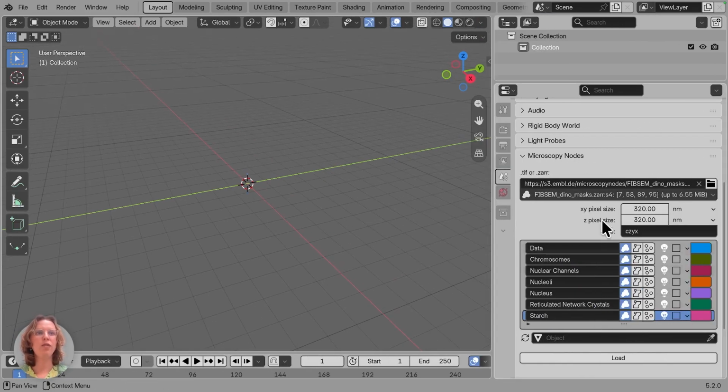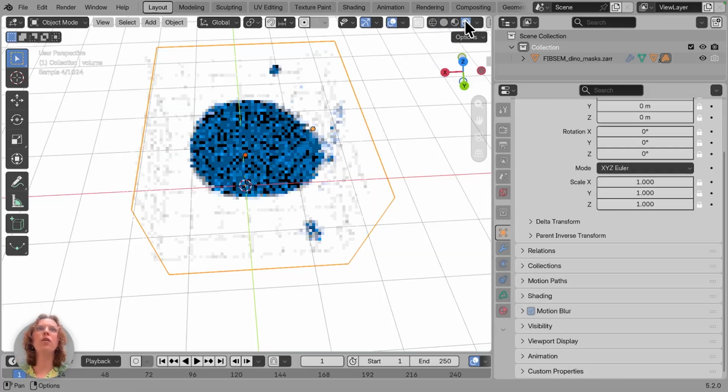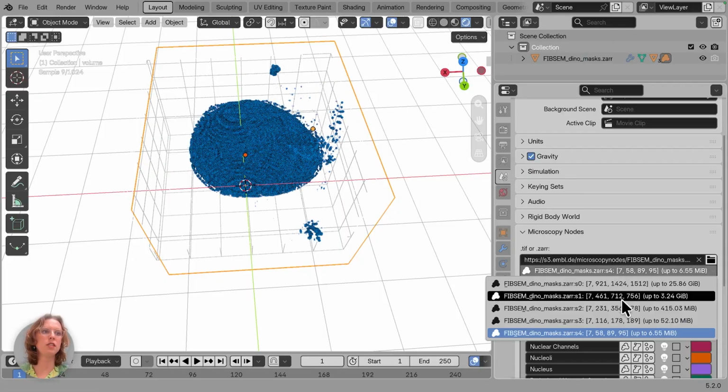And in here we find multiple channels of annotations, but we're only going to keep the chromosomes and the data and turn off the light bulb so that we immediately have scattering data. And we'll do this at the very small scale because it will make the rendering a little bit faster, and then we can later upscale this. Well, actually I might go one scale higher than this because we can see that it's extremely fragmented.